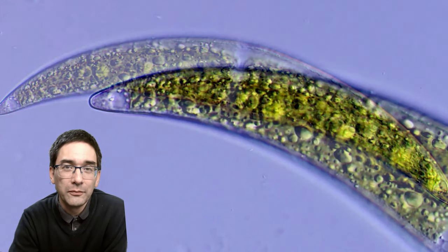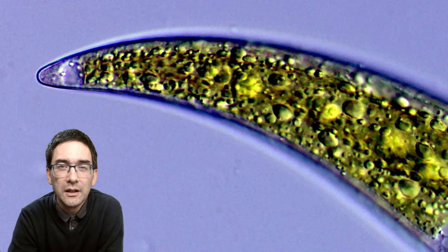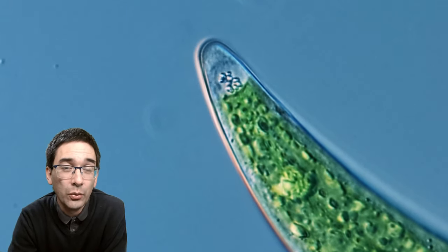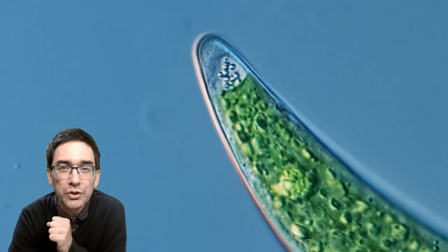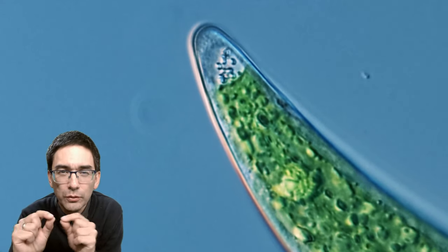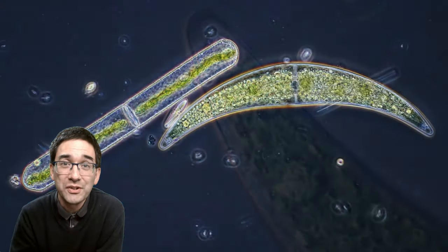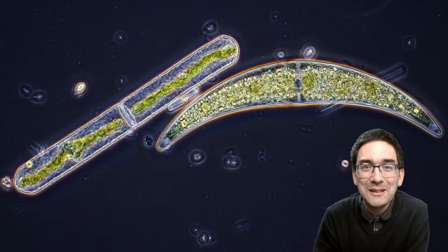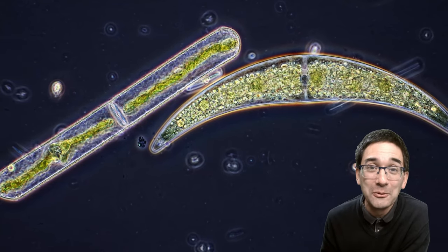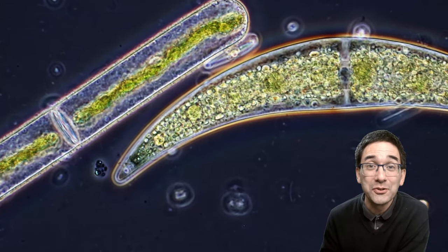My favorite one: Closterium — that's the name. If you look at the tip of this green alga you can see that in the terminal vacuole there are some little dots moving around. These are calcium or barium crystals. The function of those is not really known, but they move because of so-called Brownian motion — thermal movement of water molecules bumping into them. There are also some different contrasting techniques visible here.